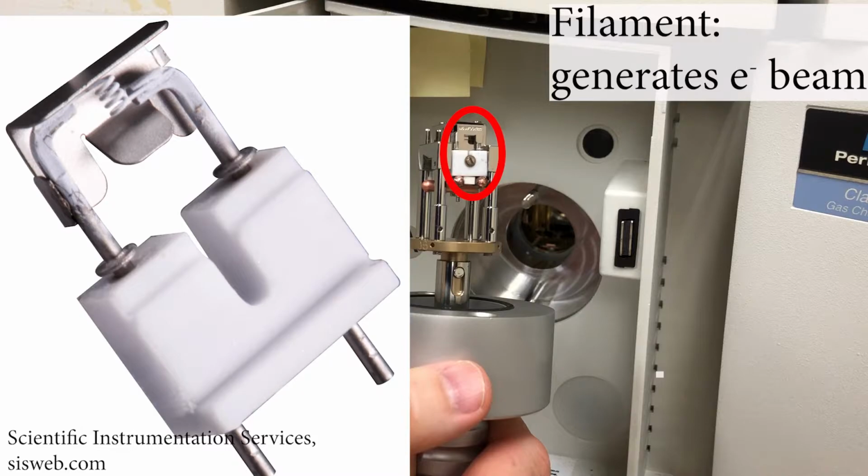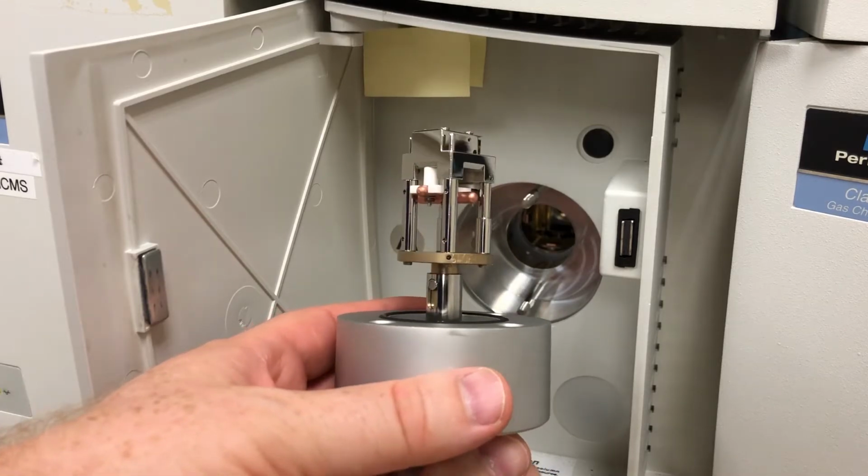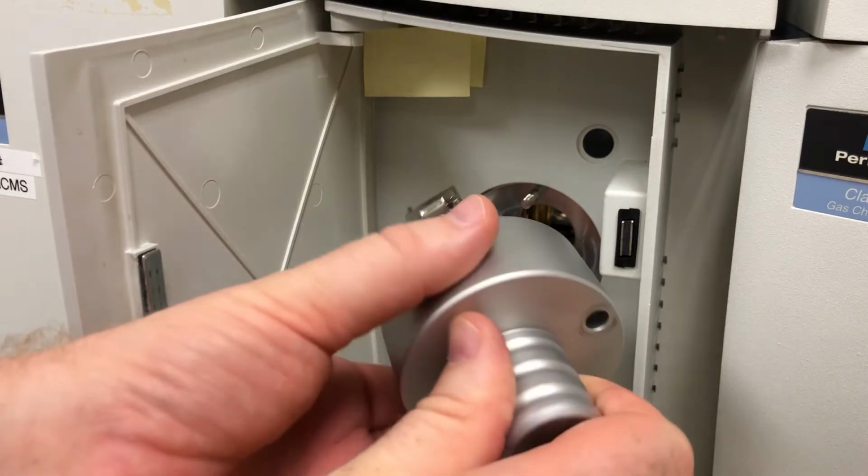So at the heart of it, we have this filament, and this is really just a fancy old school light bulb filament, but its point is it generates an electron beam. Now, for the rest of the chamber, we have a repeller, which when the ions form, pushes them out of the outlet on the other side into the mass spectrometer. And on one side, we have the hole where the column just barely leaks in, so gas can leak in.